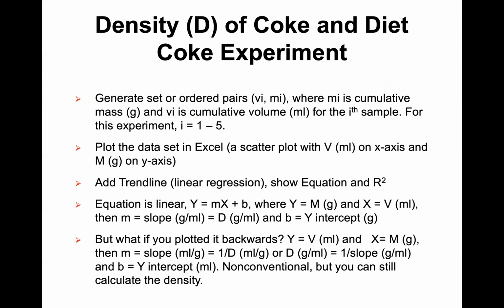In this case, you need to create an Excel file, a table like this, right? So we have this one here. For example, this one you said volume, this one's mass. Make sure to put the units here. Volume, we use milliliter, and the mass, we use gram. And so here, before we do any measurement, both are 0. We don't have any water.